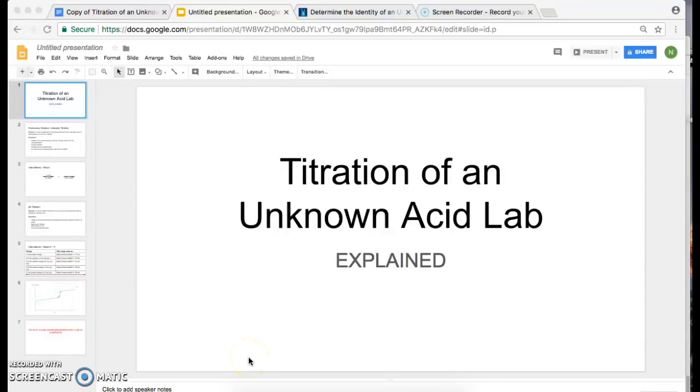Hi, and welcome to the video for titration of an unknown acid lab explained. The purpose of this lab is to identify an unknown acid by performing two titrations.